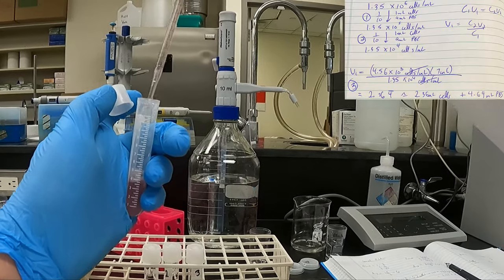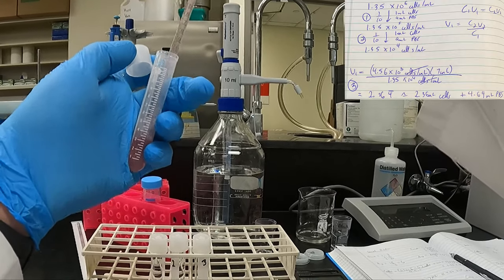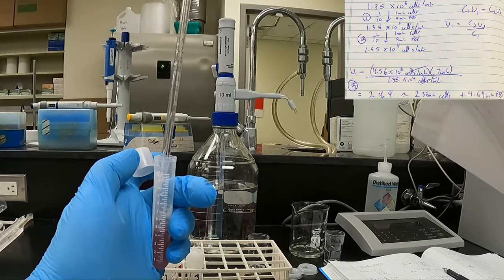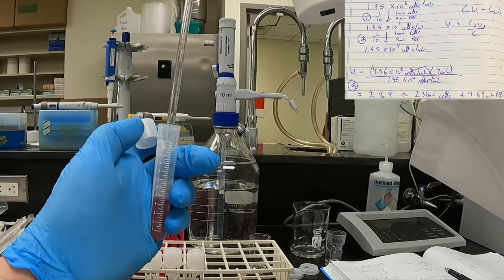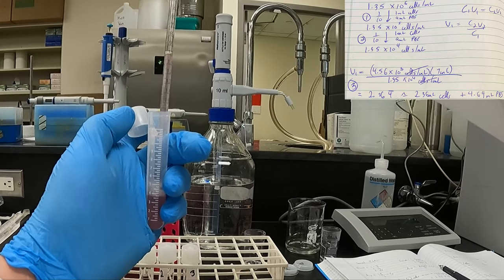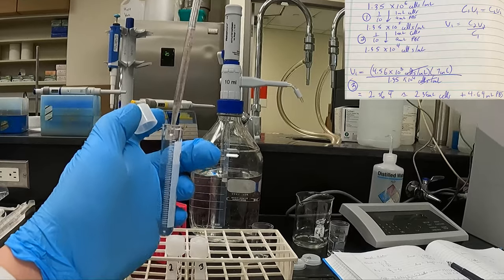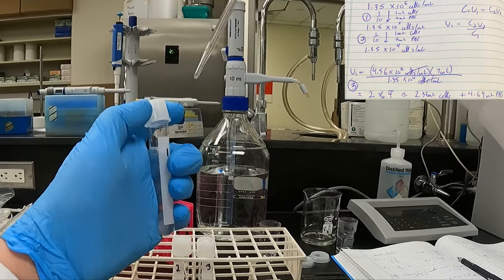Wasn't happy with that one. So I'm going to go back. Going to make sure it's done right. Bring the volume well above the 1 mil mark, and then bring it down to that 1 mil line. I'm happy with that now. Transfer that into my test tube, pipe it up and down.